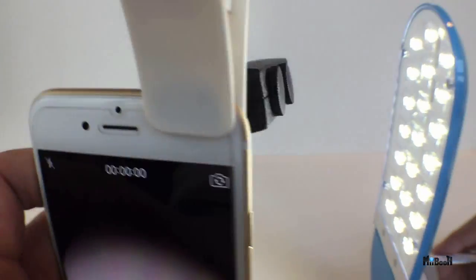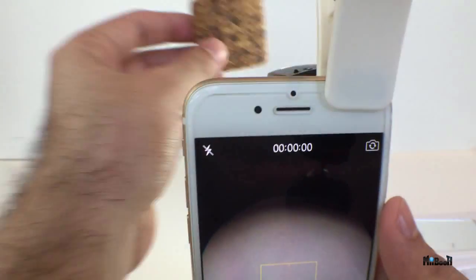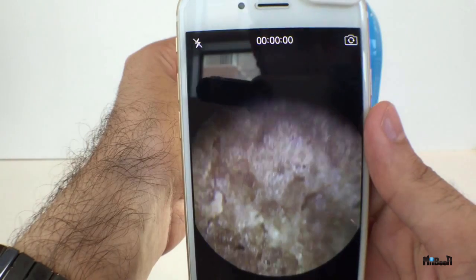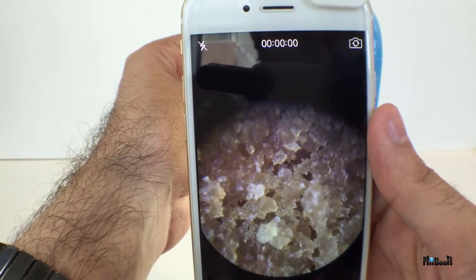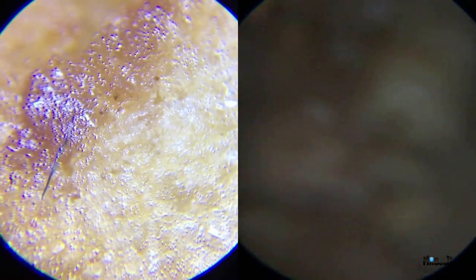To solve this, I switched off the built-in LED of the lens and instead placed a table lamp facing the clear plastic end of the lens. This provides enough light from outside to see the object clearly while avoiding unwanted reflection. You can see the difference between both the images here.